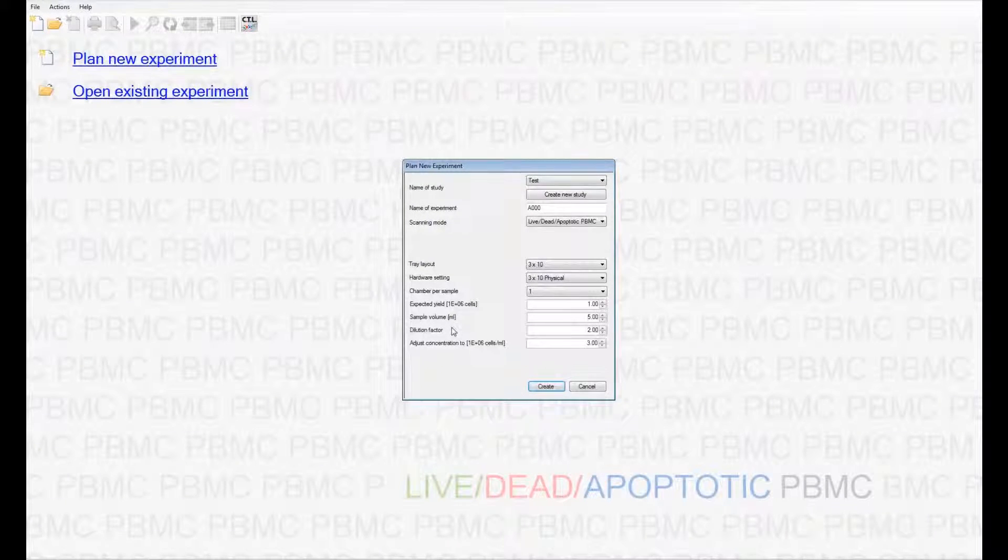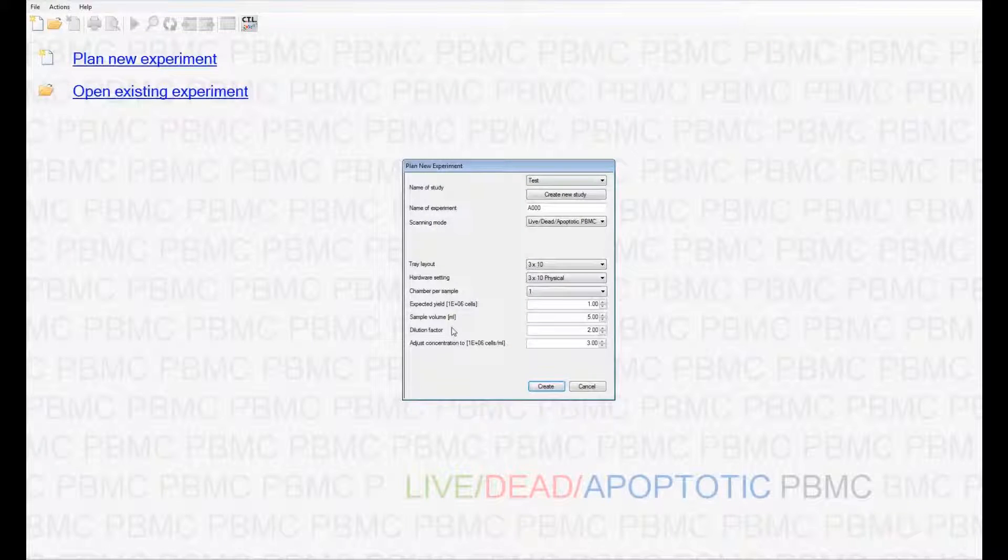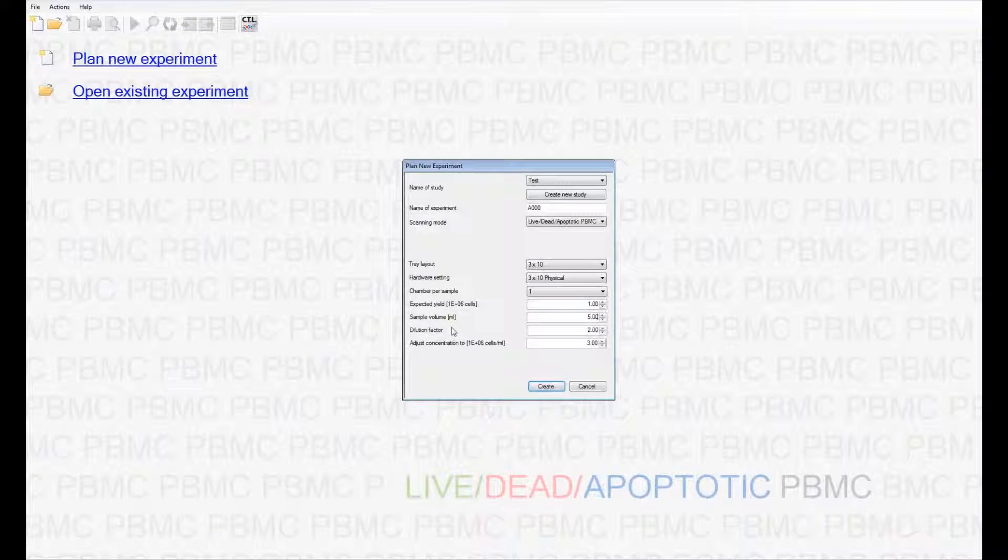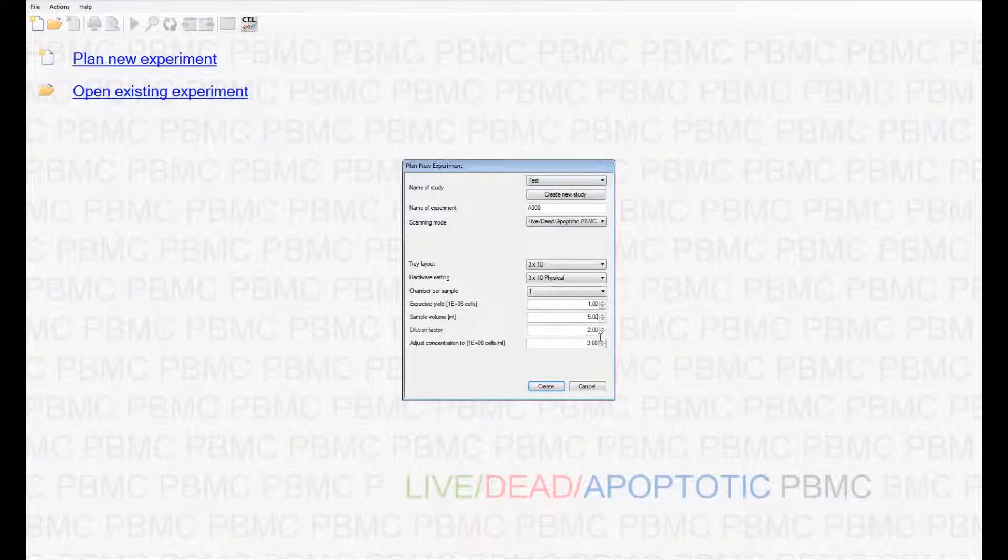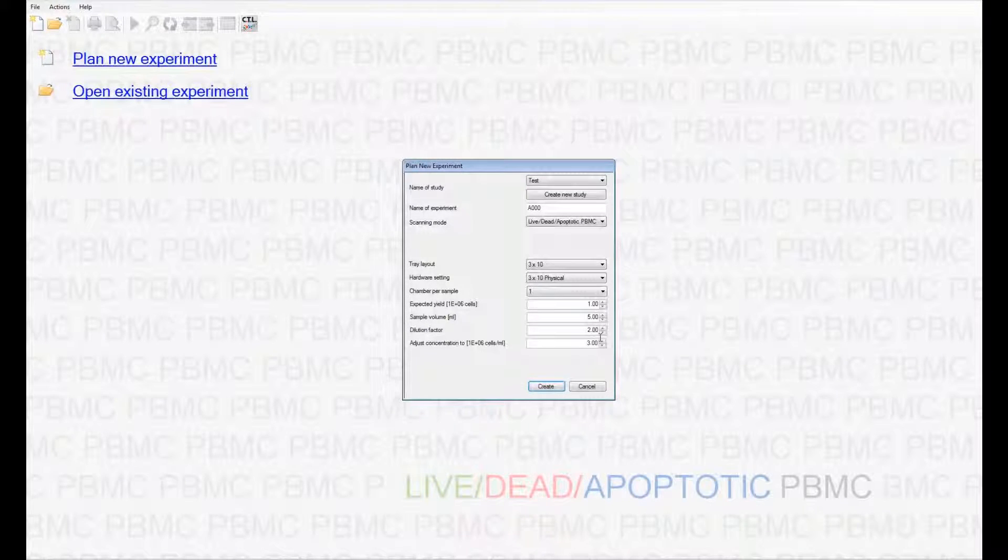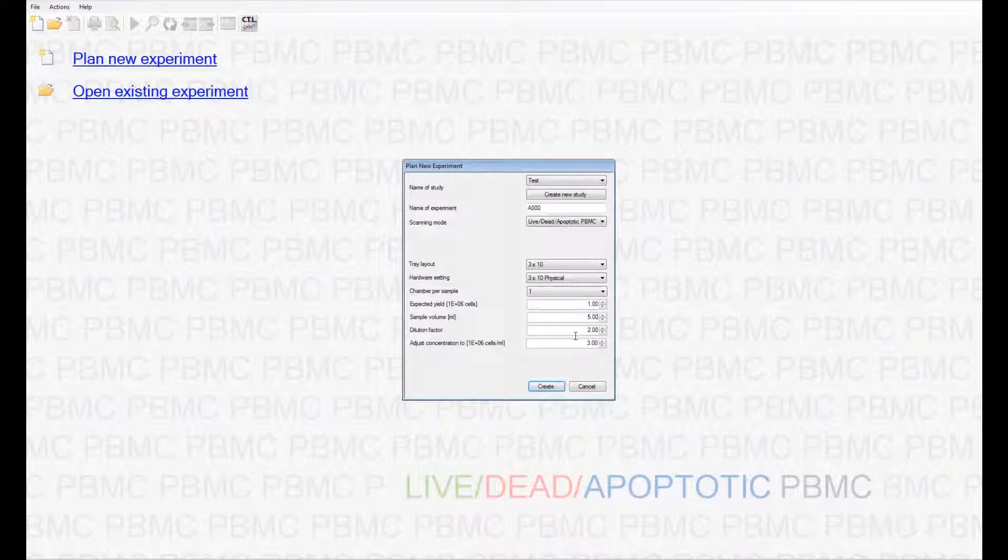You have to remember that the sample counted is further diluted in the CTL cell counting reagent in a 1 is to 1 ratio. Since I am counting my original sample, and I have added the dye to it, the dilution is 2.